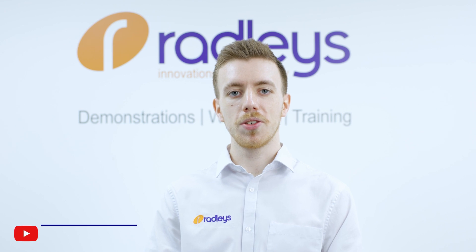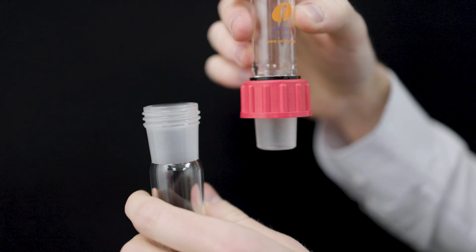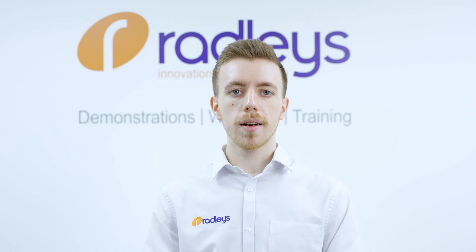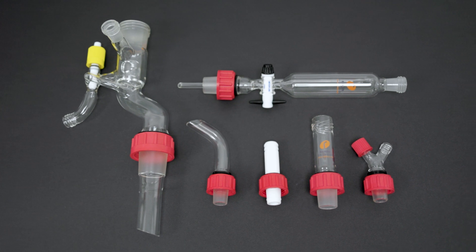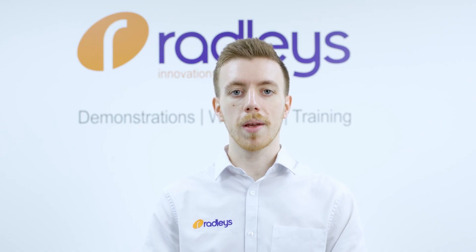Check out our video on how to unstick a stuck glass joint on our YouTube channel. Glass threaded joints are used on most of Radley's glassware, such as between Carousel 6 Plus flasks and reflux tubes. Glass threads are externally threaded glass fittings which work in combination with a standard glass joint. They come in a range of sizes and there are a variety of cap fittings to suit a range of applications.